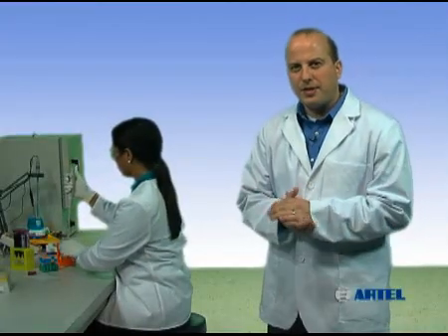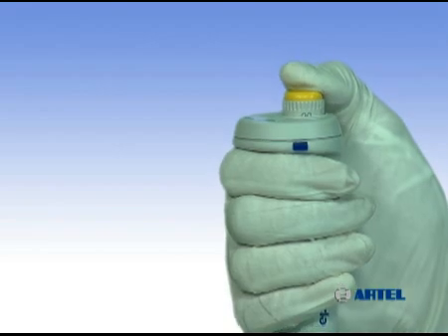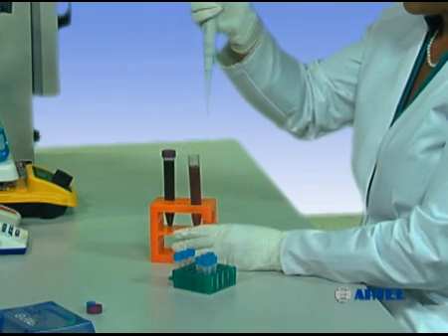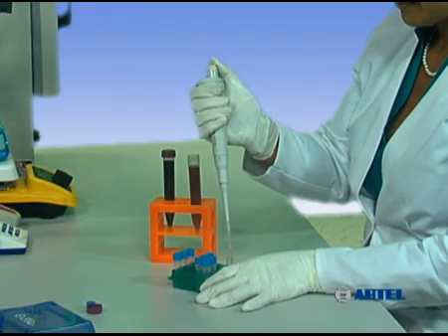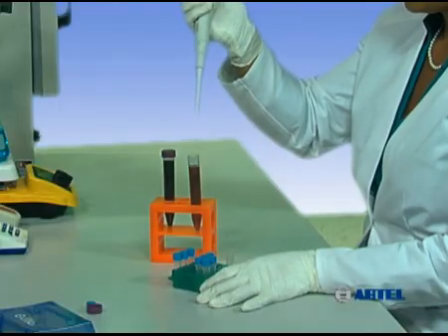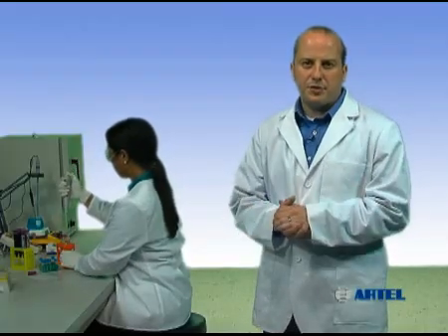Another pipetting technique is called reverse mode. When using reverse mode, depress the plunger past the first stop. Immerse the pipet tip into the sample and release the plunger. This will result in more than the target volume being aspirated. Move the pipet to the transfer container and depress the plunger back to the first stop, delivering the target volume. This leaves residual sample in the tip, which can then be discarded or returned to the sample container.